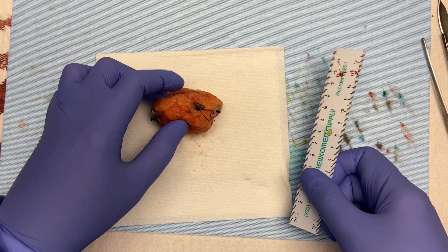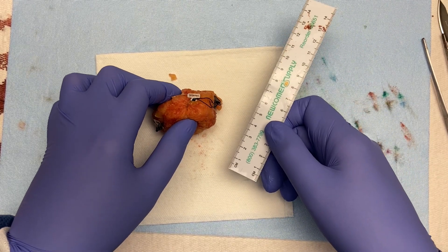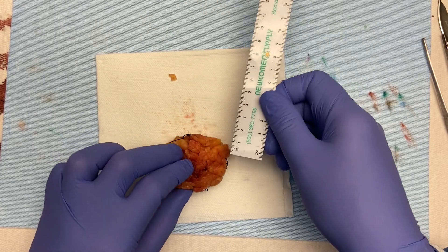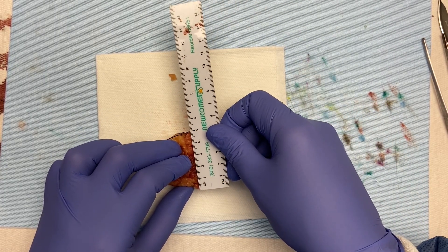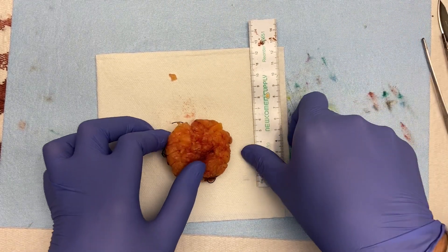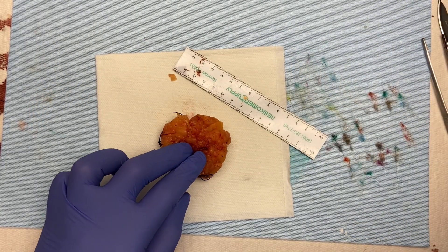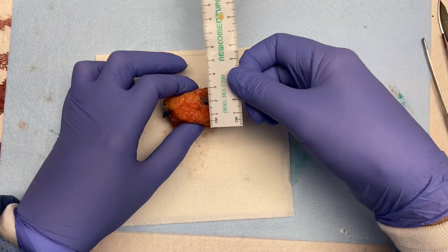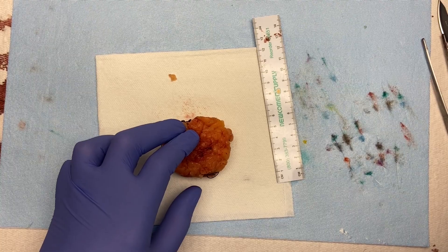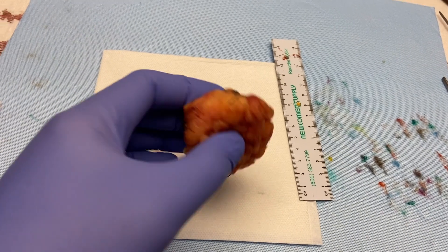I'm going to measure it, but not just in three dimensions — I'll measure it with known orientation. Cranial to caudal, or superior to inferior: 4.9 cm. Medial to lateral: 5.7 cm. Anterior to posterior: 3.4 cm.